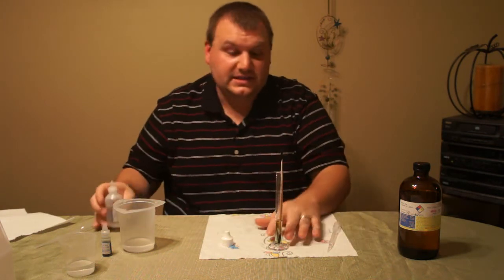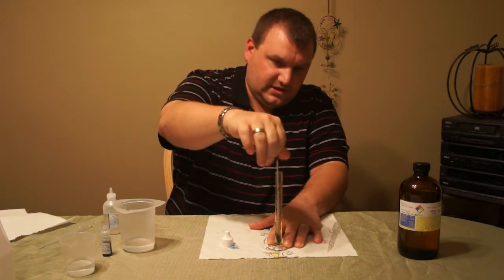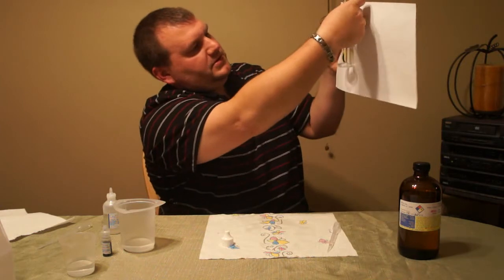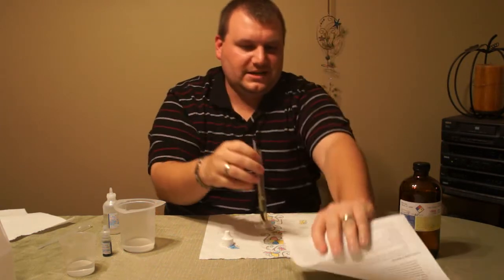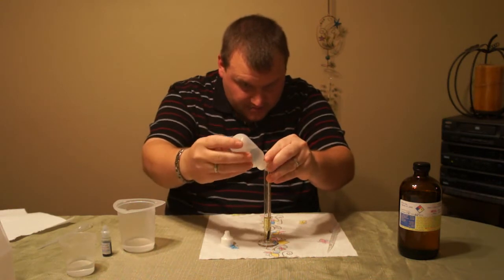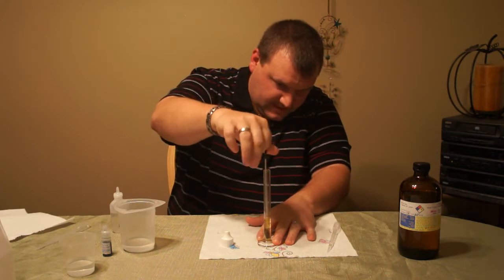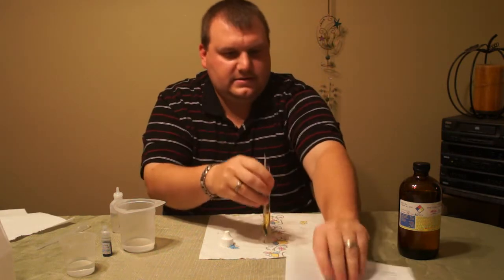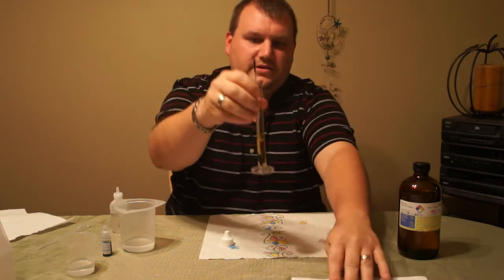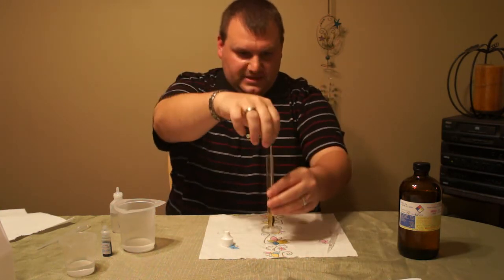Now it might be hard to see this, so after this I'll show you a close-up so you can totally tell. If you hold it up against a white piece of paper, right now it's like greenish-yellow. So I'm going to add a couple more drops — one, two. And I think that did it. Now it's a nice yellow. The stir rod is actually white, so it makes it a little bit easier to see.